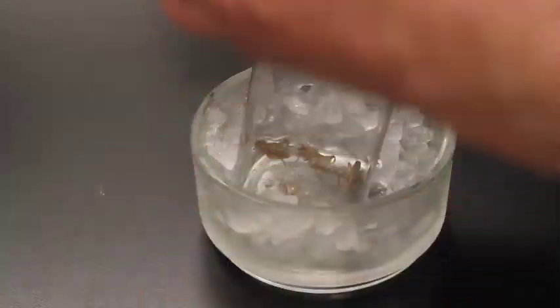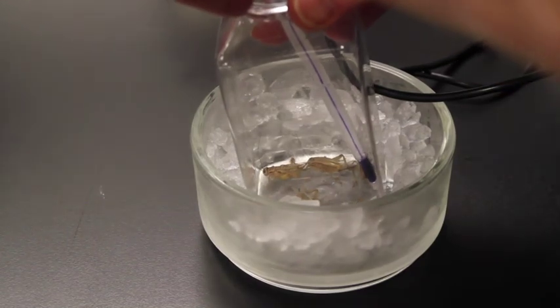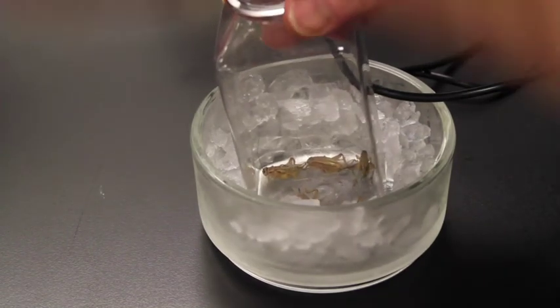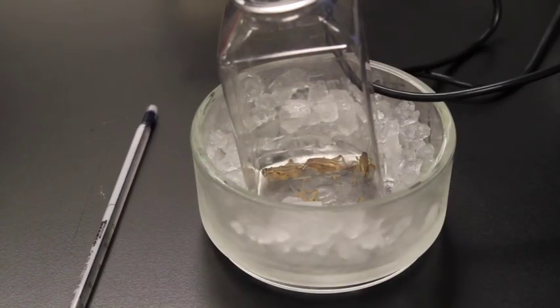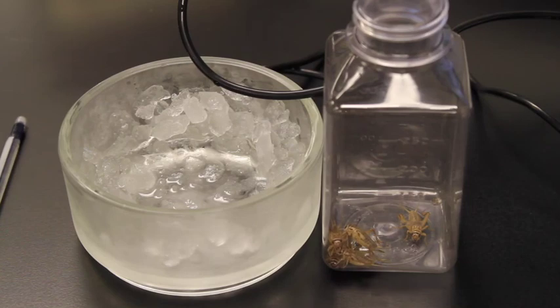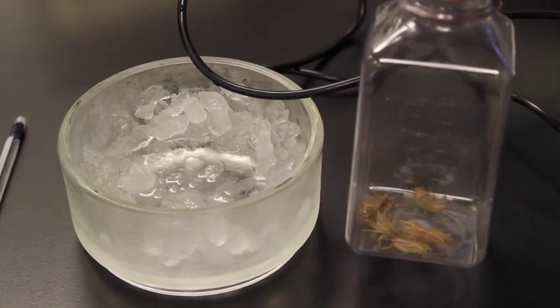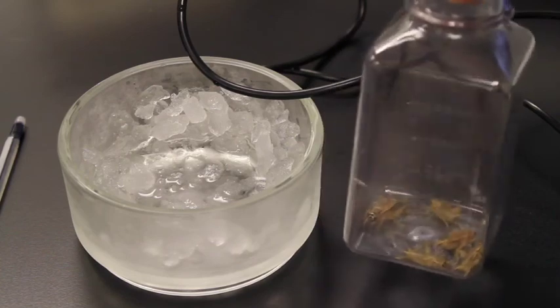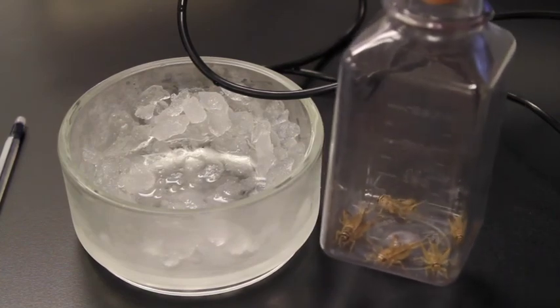Now, temperature-wise, I just checked the temperature a few minutes ago, and our temperature in here was down to about 9 degrees. So the temperature is 9 degrees C. At the beginning, it was 20 degrees C. And just to show you that no crickets were harmed in this study, we let them sit about 5 minutes here and warm up, and our crickets are all back up moving around like they were before. So back to normal.